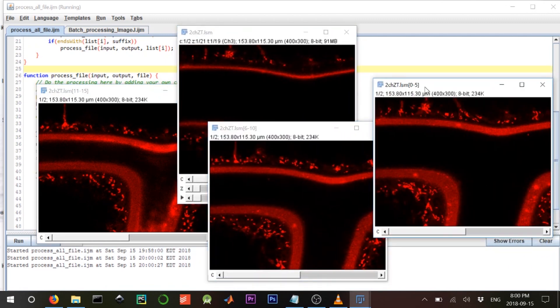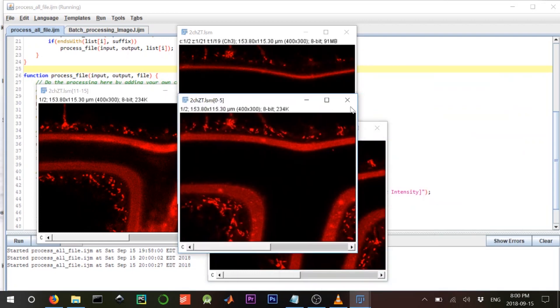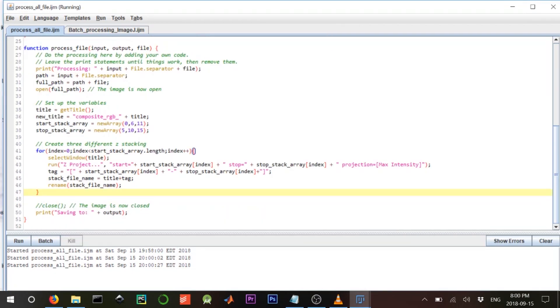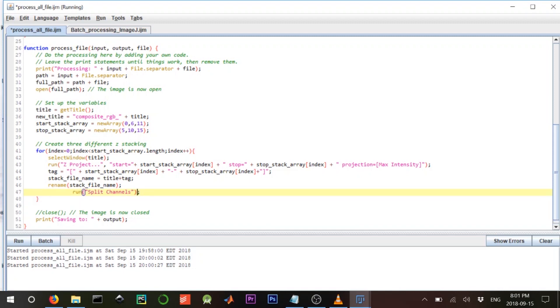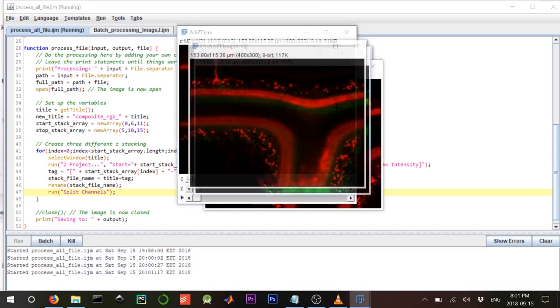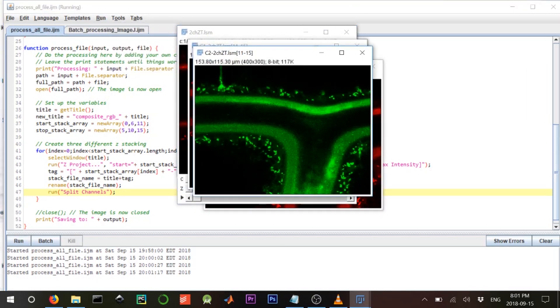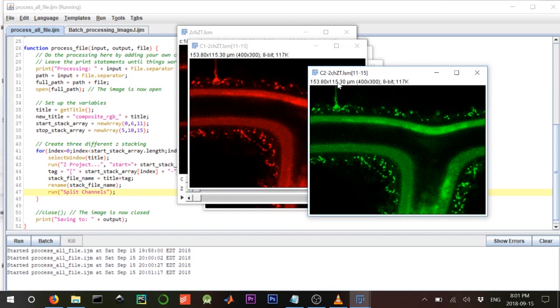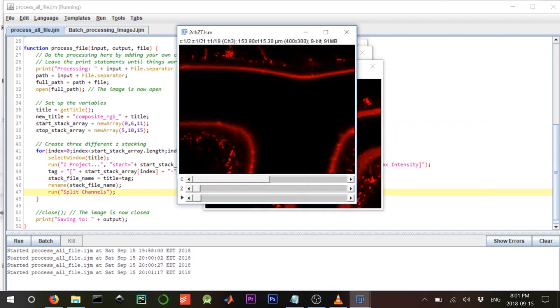What's left is to split the channels, because there was a red and a green. We're going to split them and then merge them into one file. After running split_channels, we now have many files open — channel 2 for one file, channel 1 for another, and so on. Now we need to merge them together.